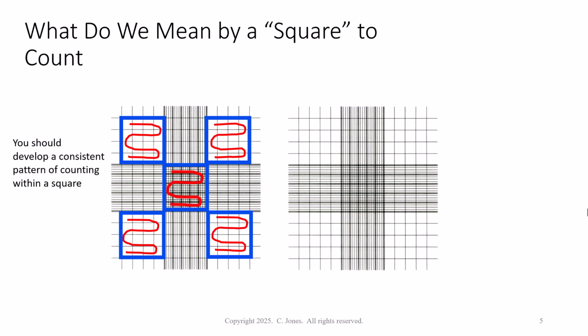Okay. In the previous slide, we talked about what's outside the large square and what's inside. So here you can clearly see, I hope, the cells that would be inside the large square. That's where we do the count. But we have the outside of the square, right? So that's the portion up here. So that's the portion up here.